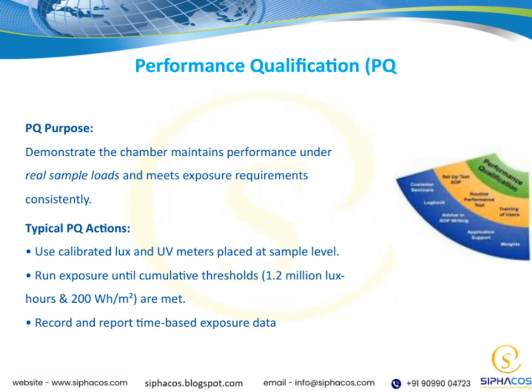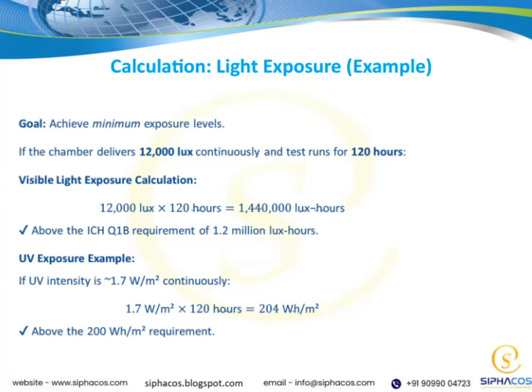Finally, it's important to record all the data related to exposure over time. This data is then reported to confirm that the chamber's performance aligns with our standards. Overall, PQ is a crucial step to validate that our chamber can reliably produce consistent results, ensuring the quality and safety of our products. Let's walk through a simple example of how we might calculate light exposure. This slide highlights the key points involved in that process.